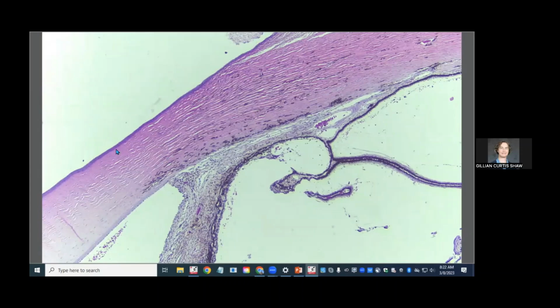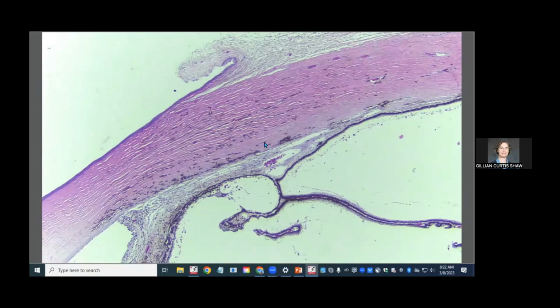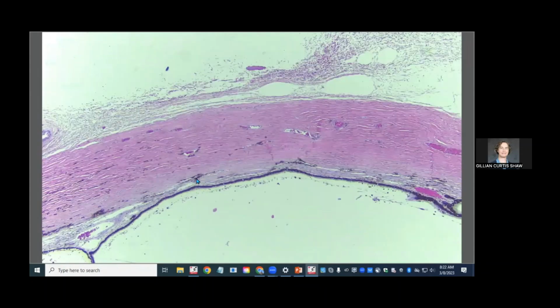And I think it normally angles this direction, actually. And here, if you follow the pigment, which is usually present in the limbus, right at the limbal line there, it sort of angles back the other direction. We also don't really see much in the way of angular aqueous plexus, at least up here, where you'd think those little channels should be to collect the aqueous humor. There are some, but they're fairly posteriorly displaced.